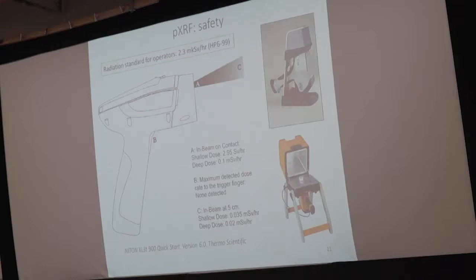And talking about safety, in general, X-rays may kill, damage, and cause genetic change in biological tissue. This is the basis for X-ray health hazard. This hazard is insidious because X-rays are invisible and otherwise undetected by human senses. But let's take a look at the actual doses that can be received by an operator when operating portable spectrometers.